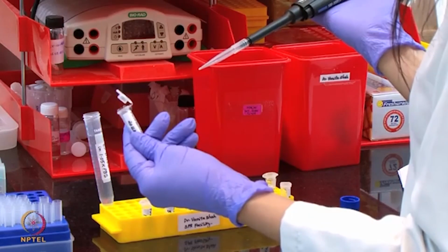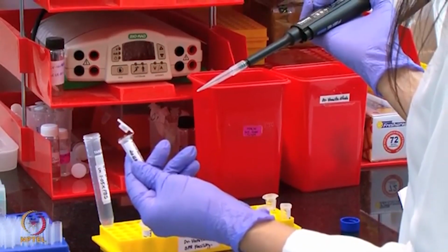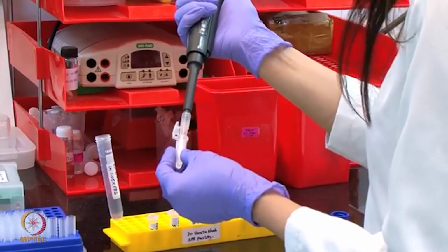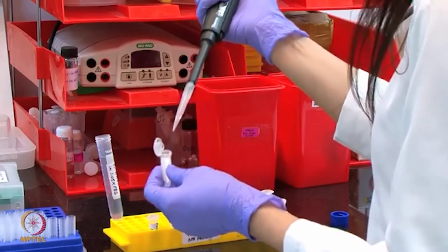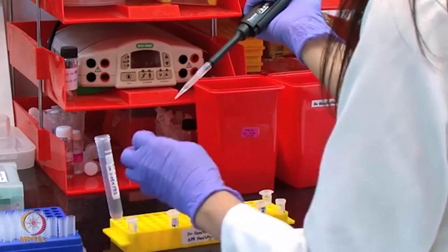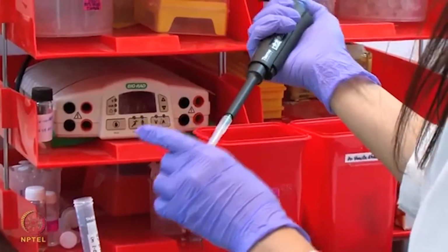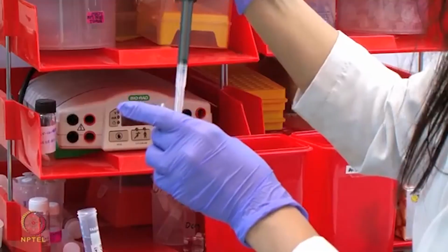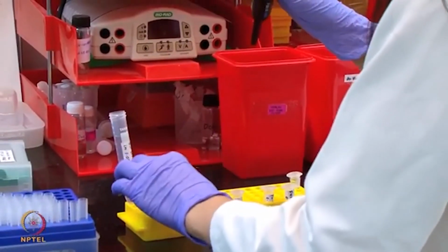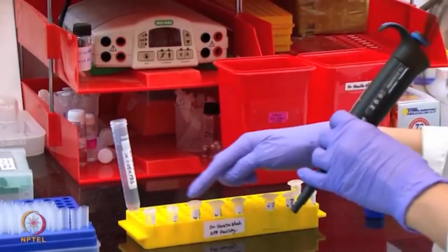We will prepare this concentration series in 2-fold dilution using running buffer starting from 20 micromolar, which means we will mix 200 microliter of 20 micromolar protein with 200 microliter of running buffer to get the 10 micromolar concentration. We similarly continue the 2-fold dilution to obtain the rest of the concentration series.